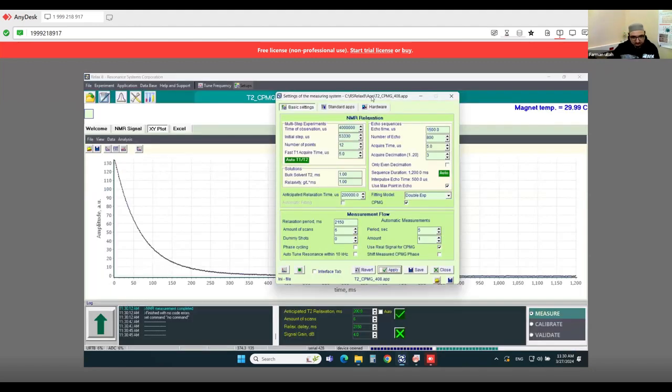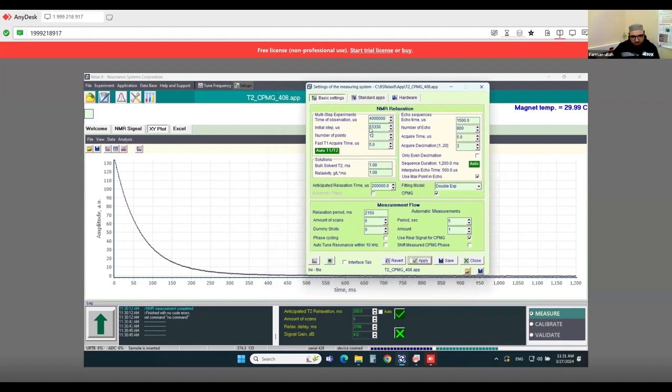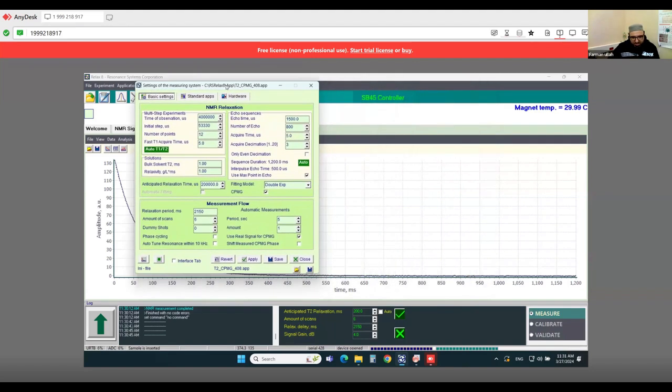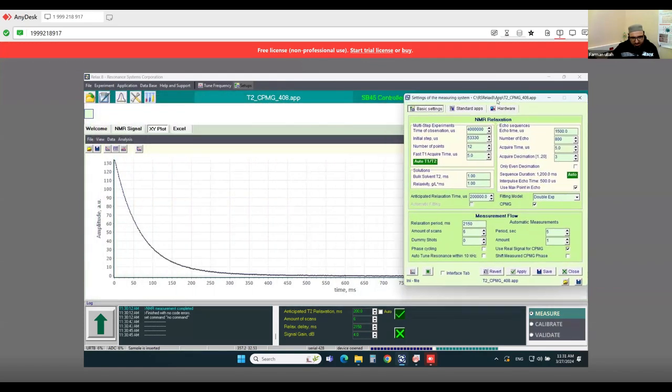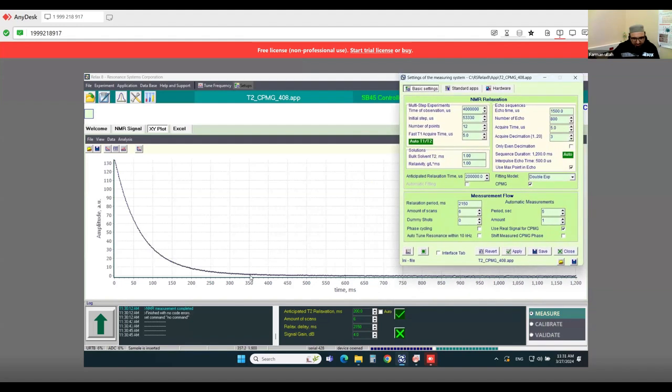Because this, okay. So I told before this problem, if anybody has some problem like the setting is not shown, you can press Alt first step. So I do this, I see my setting. Now I will change these things, because you can adjust from here, from the start, from where you see that it goes to decay, fully decay, go to 0. You can also cut from here, and this is observation time. You will set according to here.